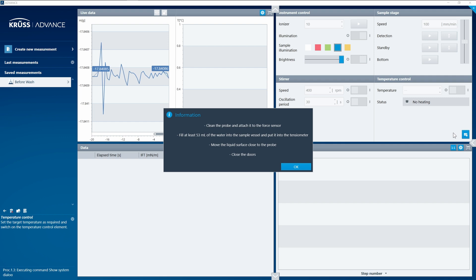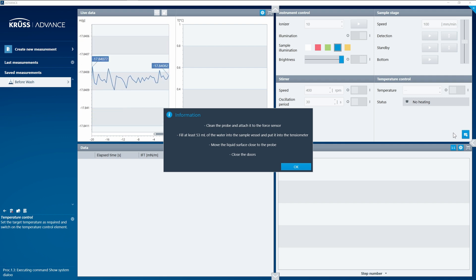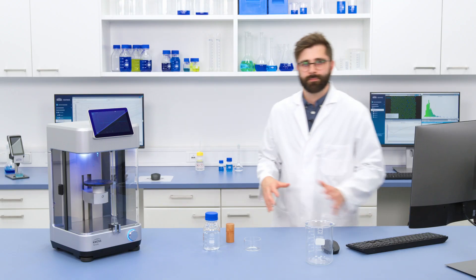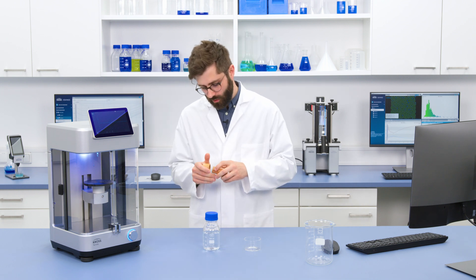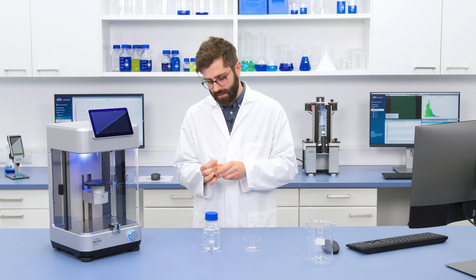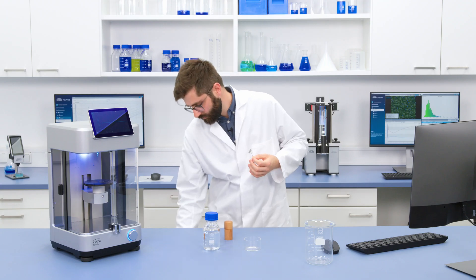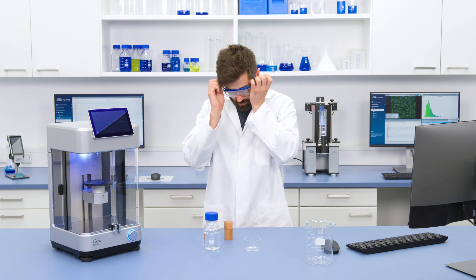ADVANCE gives me a prompt with a series of instructions on what I need to do to get the measurement ready. In this case I'm going to be measuring with what's called a Wilhelmi plate. The Wilhelmi plate is a rectangular plate of platinum and is probably the most commonly used sample probe today. There are other alternatives, like the du Noüy ring, which works in very much the same way. One of the most important things before doing a ring or plate measurement is that we first have to activate and clean the surface of the plate.